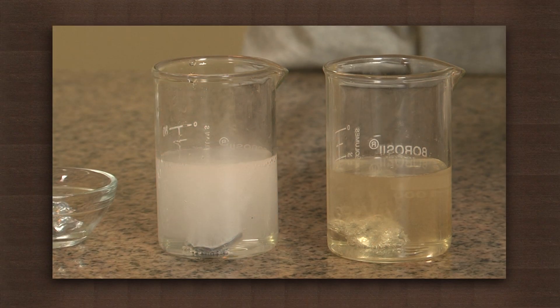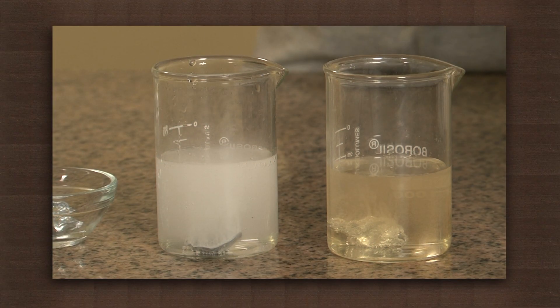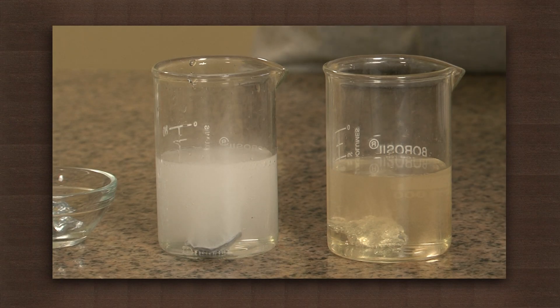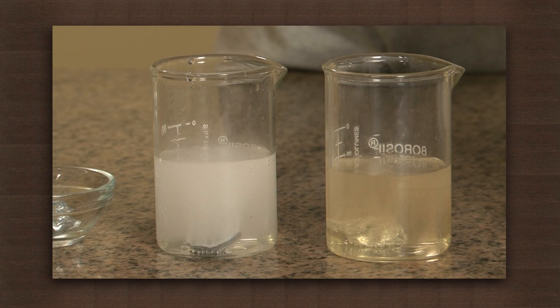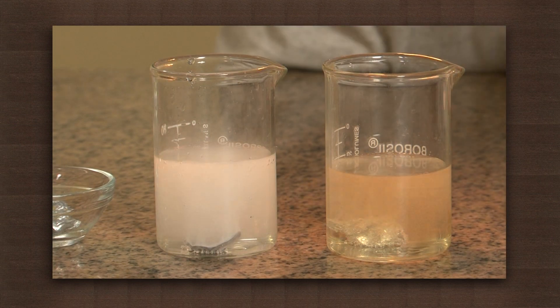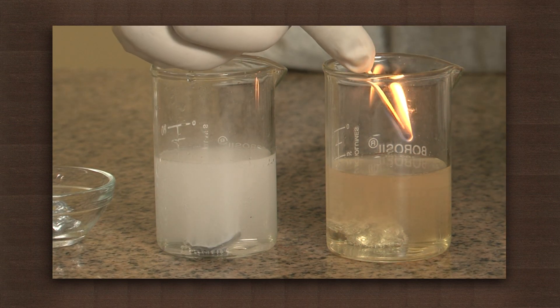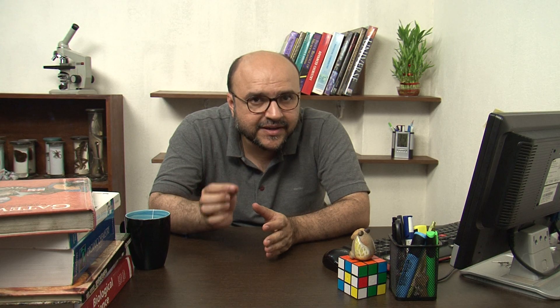Let's try it again. Take the beaker containing dilute sulphuric acid instead. Test the gas formed using a lit matchstick — listen carefully for the sound. The pop sound is a clear indication that the gas involved is hydrogen.